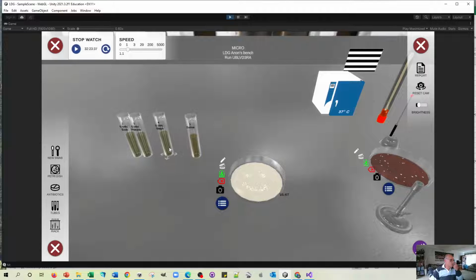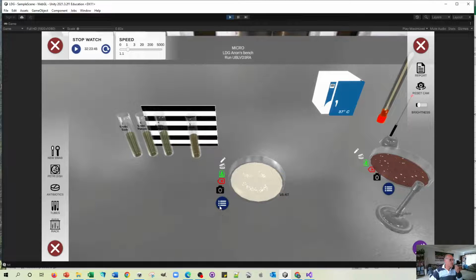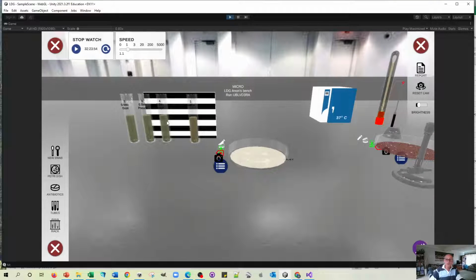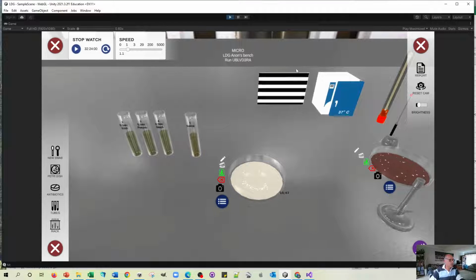Now these solutions here are just standard solutions. They're to be used in contrast with this little grid here that allows you to get some sort of visual feel for what the concentration of the suspension is. Again, that's something that the staff at the University of South Australia use to gauge how much bacteria have been resuspended. So lots of options there.